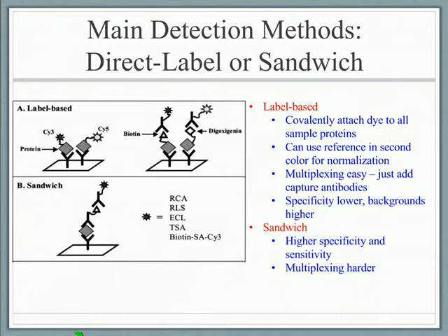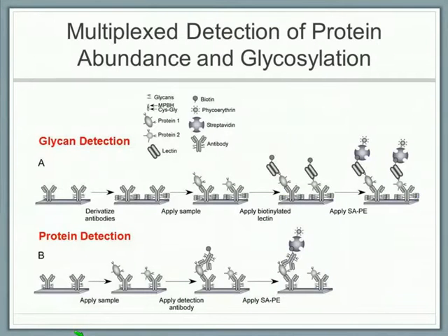The commercial developers of the panels of multiplexed assays have worked through all those issues of the cross-reactivity, so that takes out that level of preparatory work for the researcher when using some of the commercial panels. But if you are developing your own panels, that needs to be systematically addressed, as whether there's any cross-reactivity between the detection antibodies. It was really for that reason that we worked on a couple of alternate formats for multiplexing I'll tell you about in the next slide.